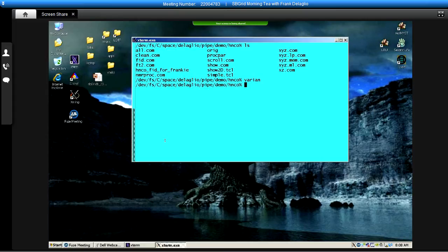We'll see the details of starting with raw data from the spectrometer, how to convert it to NMRPipe format, how to inspect it, choose phase correction parameters, and build processing schemes. Then we'll see how to display spectra and to generate peak tables from the spectral data. The first part of the demonstration will show all the manual methods for carrying these steps out, and then at the end, we'll have a glance at methods that automate all of these steps.